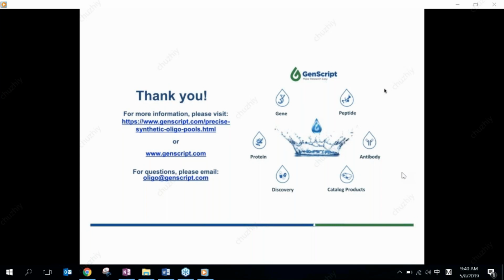Okay. And is it possible to identify any synaptic jumping AAVs using this screening method? Well, I haven't seen any AAV so far that can jump a synapse. So if someone has one of those capsids, it would be interesting to see it. No, we haven't seen any synaptic jumping. But if the person who asked this would like to give some more information, I would be happy to look into that.